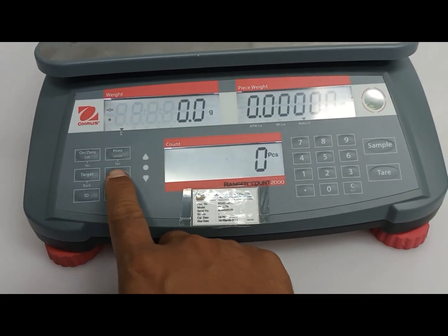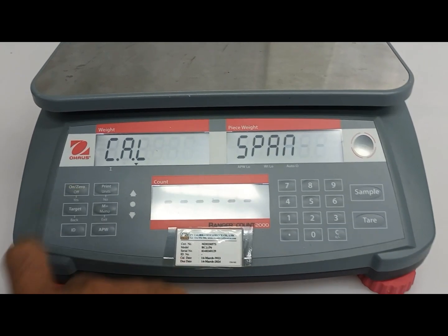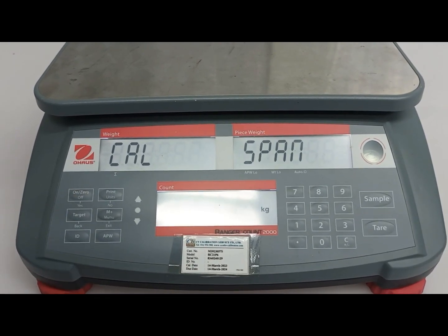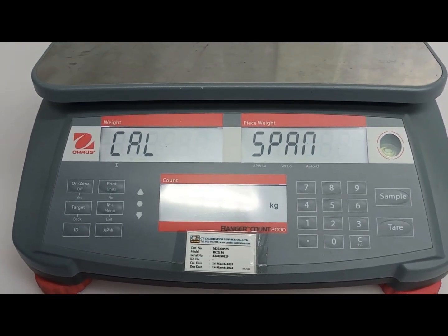I will press the menu key, so to count. This one to span — enter. This one shows 0 kg.